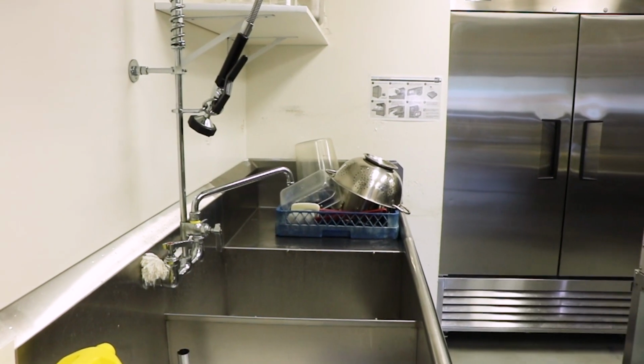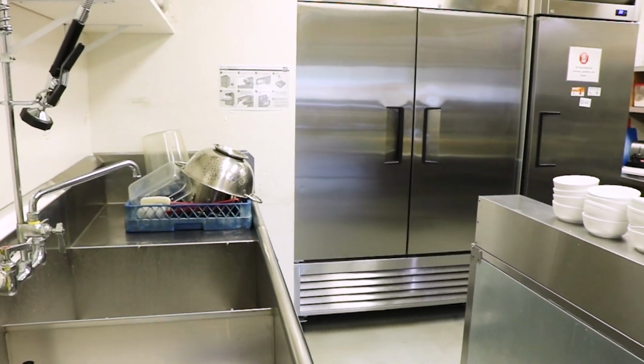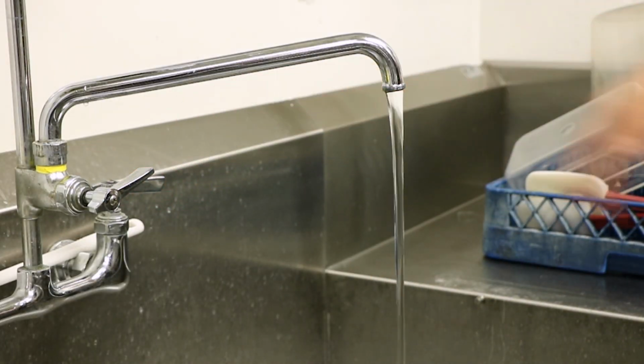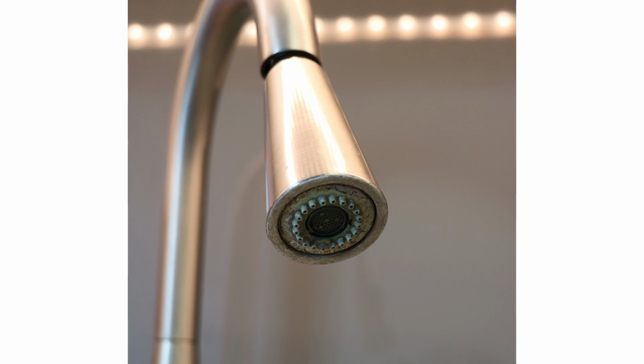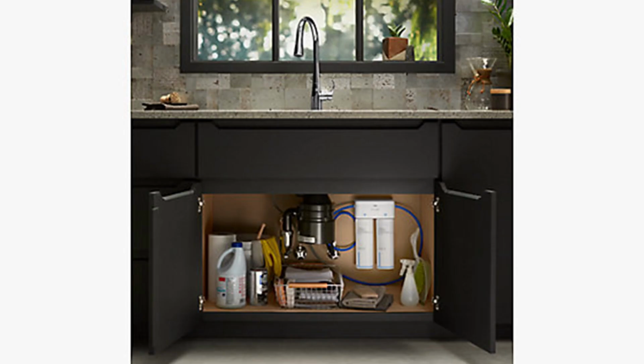Once you and your environmental health officer have discussed the best sampling locations within your community, it is time to find the best sampling tap for each site. Choose a cold water faucet, ideally one with a smooth end that has no attachments, which can be cleaned and disinfected easily. Never take your samples from visibly dirty faucets, garden hoses, faucets in workshops, garages, bathrooms, or other unclean areas. Never take your samples from faucets that are connected to water softeners or other treatment devices, unless you are testing the effectiveness of the treatment unit.